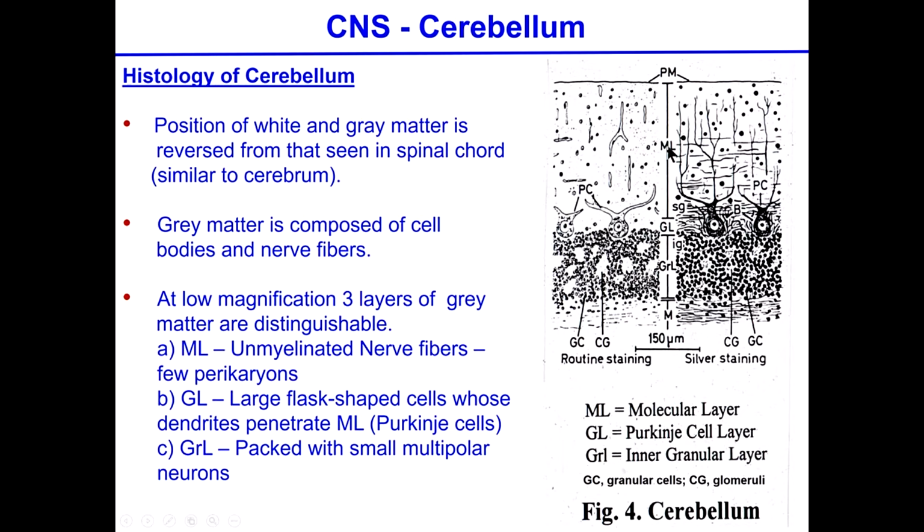the cortex, and what you find is pretty much a region that, depending on the staining, and that's something I tried to mention also, what you see or don't see in histology is extremely dependent on the stain that you use. And we'll see in the lab, I'll show you two different pictures of the spinal cord, and you'll see the huge difference between the two stains.